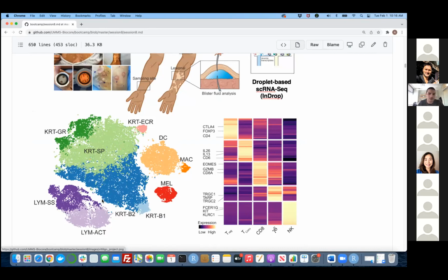We can just isolate the T cells, which are the lymphocytes over here. We can see which of those have more interferon gamma or not. But in this case, there are only 10 patients over here. So this actually shows the power of single cell analysis. With just 10 samples, you can generate data with numerous expression profiles that gives you a lot of room to do detailed analysis.